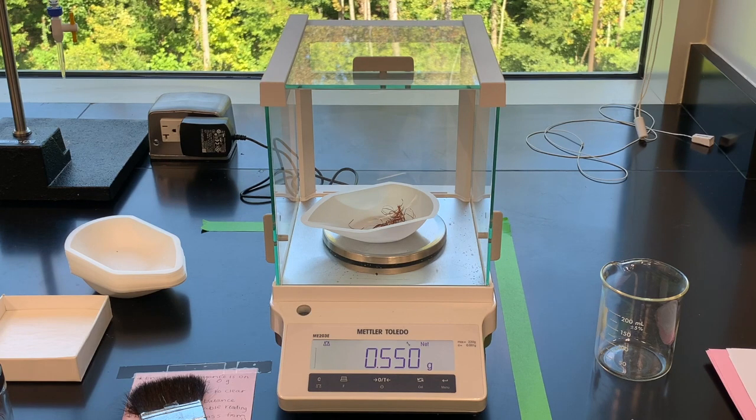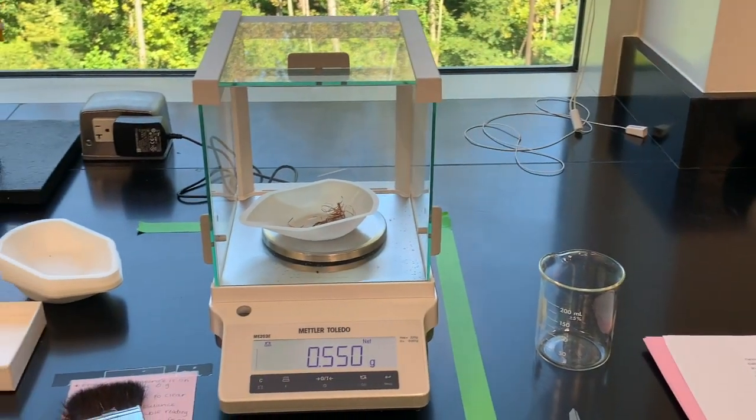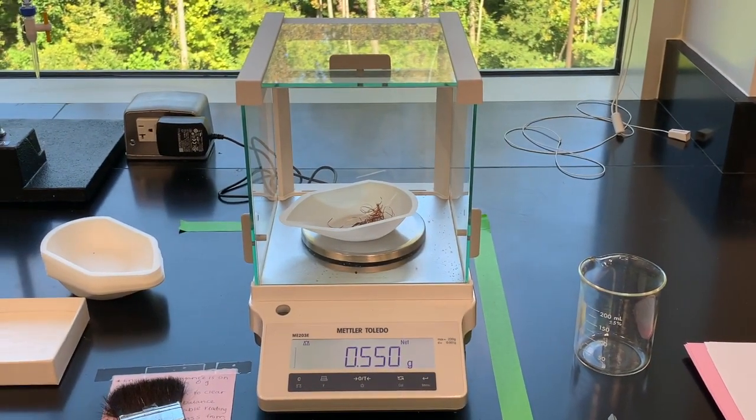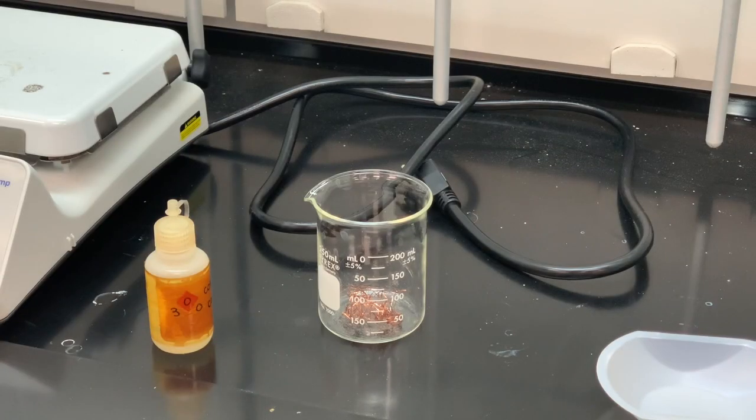So now we're going to take this copper to the hood. We're going to put it into that beaker and start with the first reaction between copper and nitric acid. Right now I have my copper in my beaker. I'm doing this in a fume hood. All of the reactions today will be conducted in the fume hood.